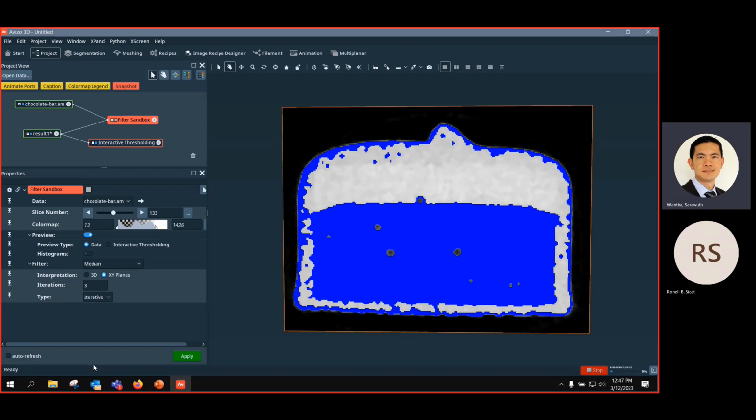And then when you are using the data, you select only certain pixels within a certain threshold limit.